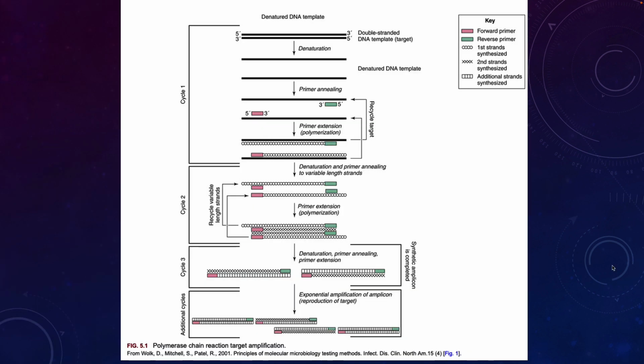So this is what PCR looks like. Again, you should all be familiar with PCR. If you've taken genetics, you should have taken genetics, cell biology, things like that. You've talked about PCR, you know what it is.